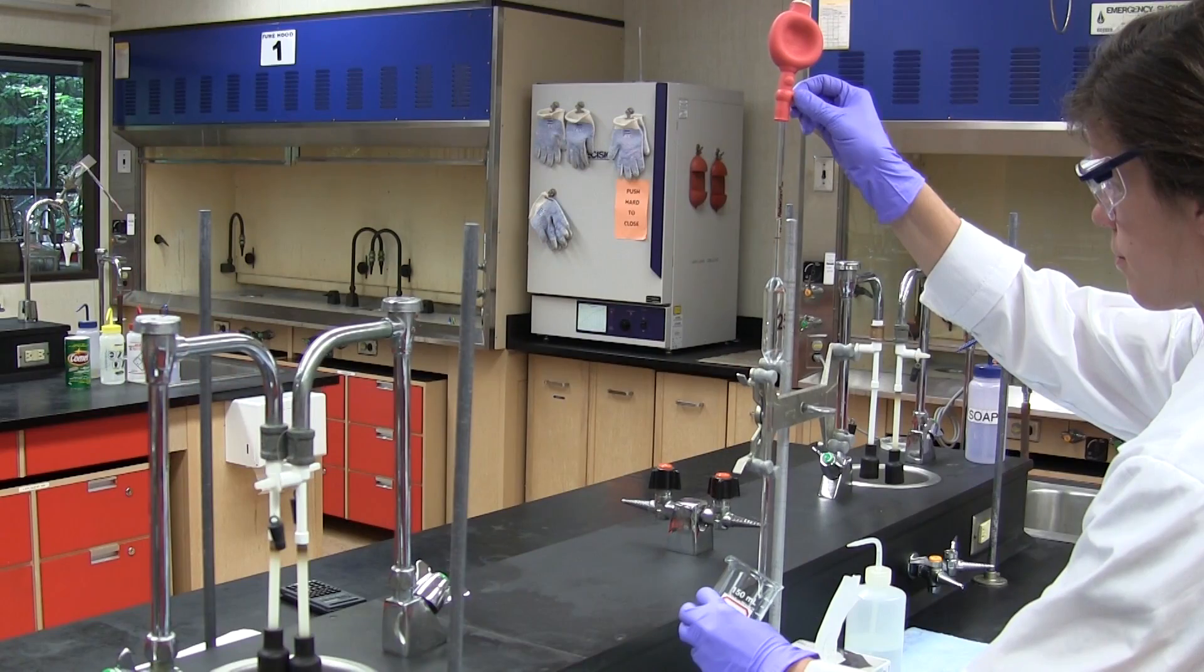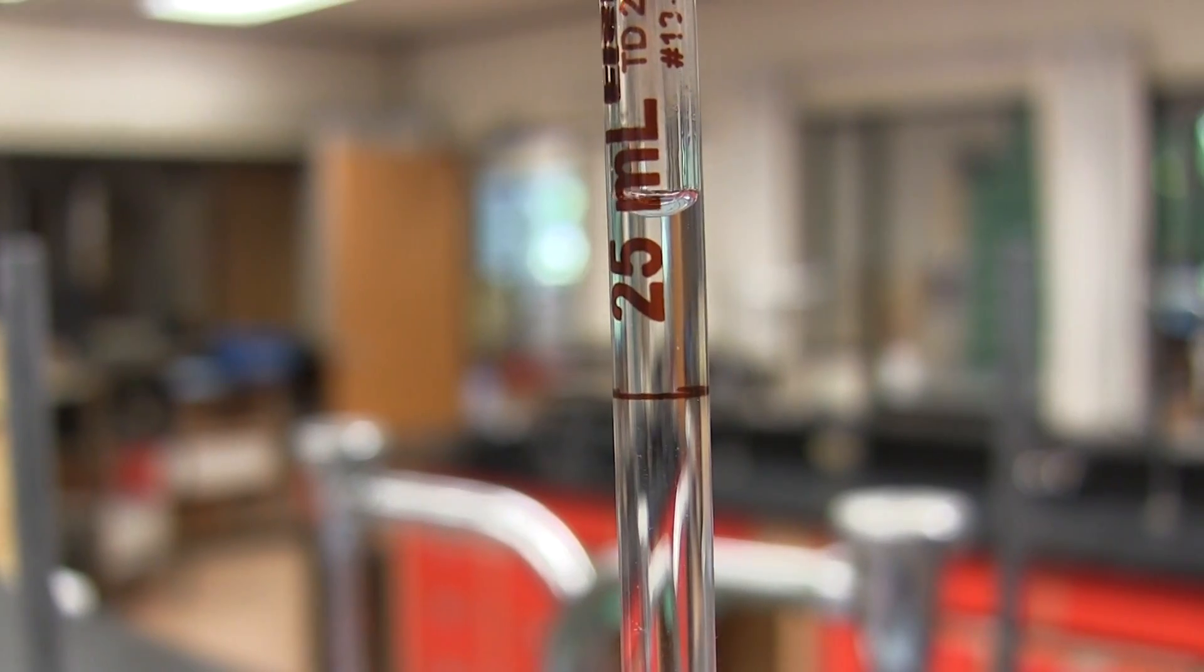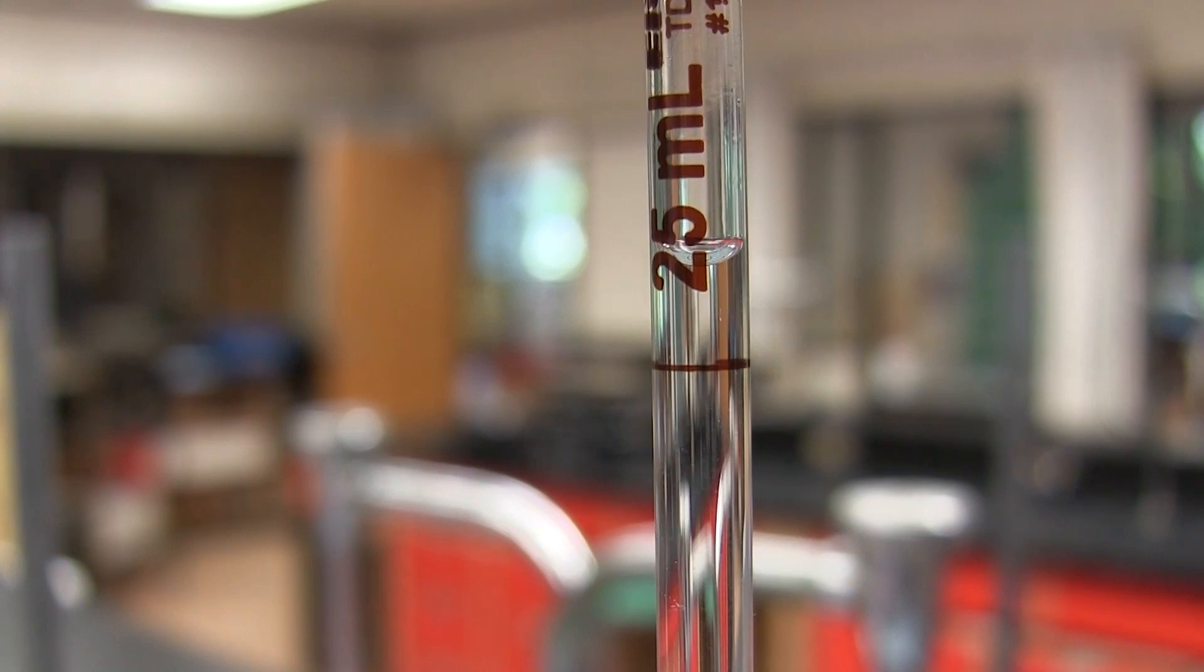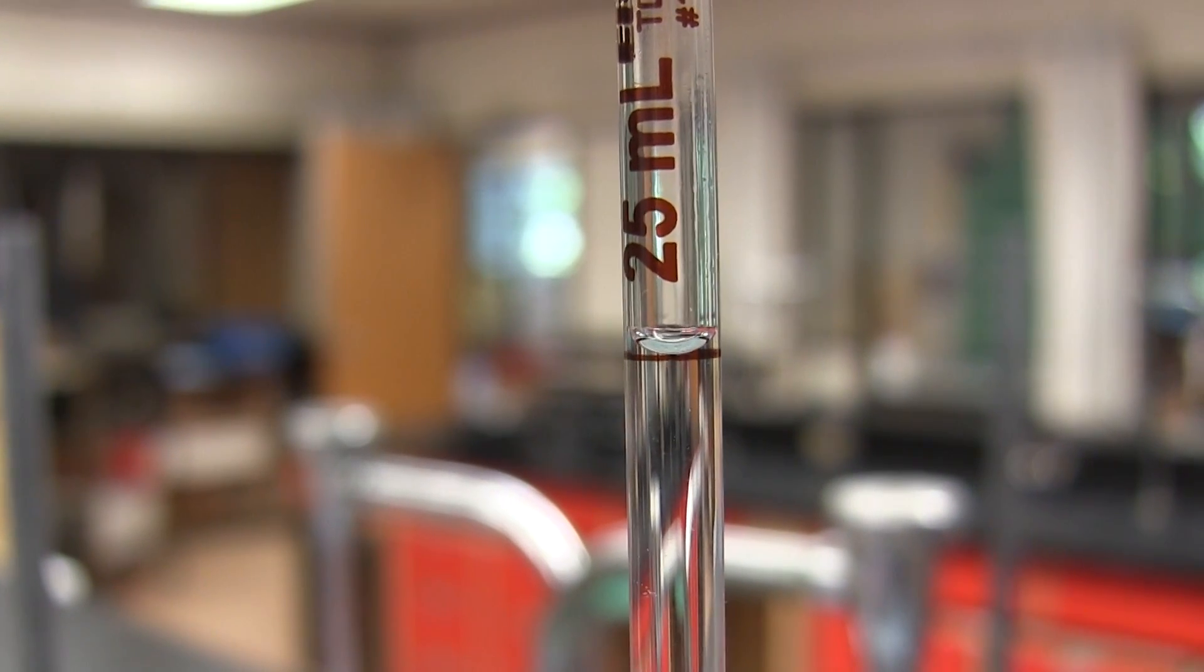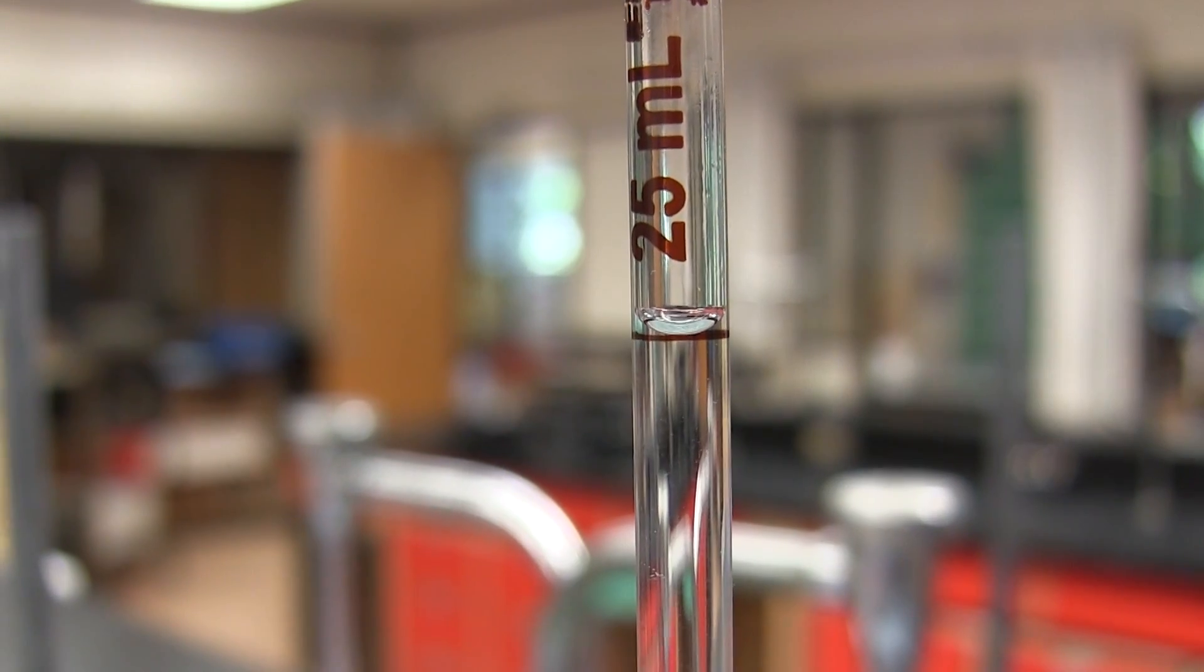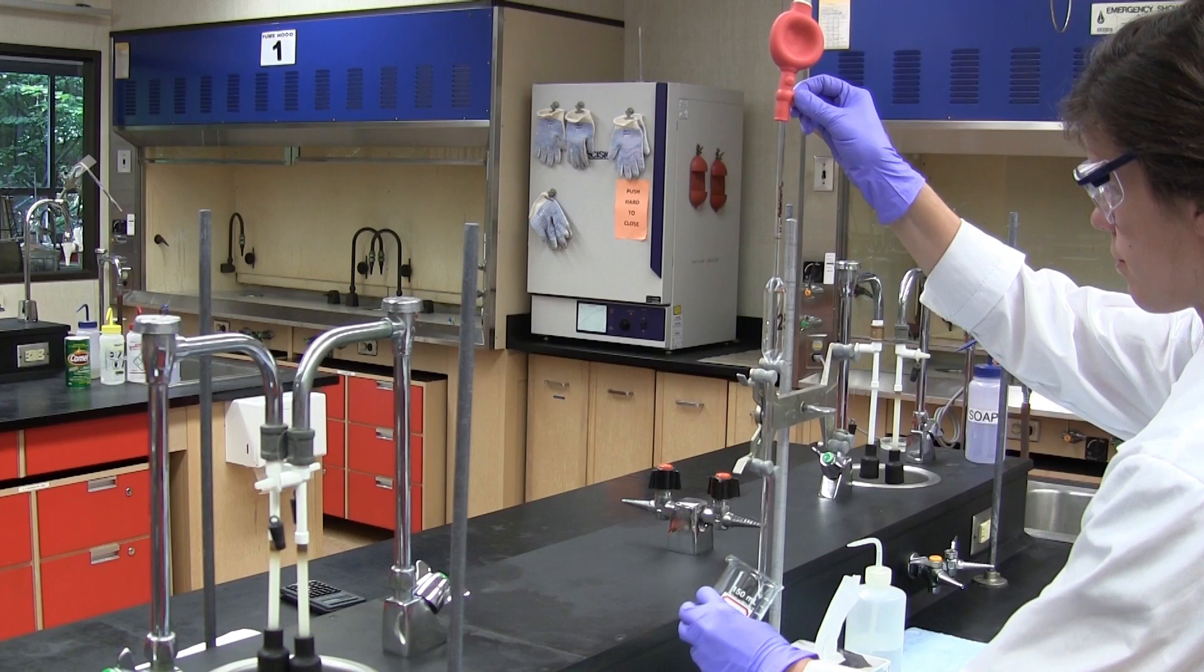Holding the tip of the pipette against the inside surface of the beaker the liquid is allowed to slowly run out of the pipette until the meniscus is resting on the calibration mark. Be sure to keep your eye level with the meniscus when doing this.